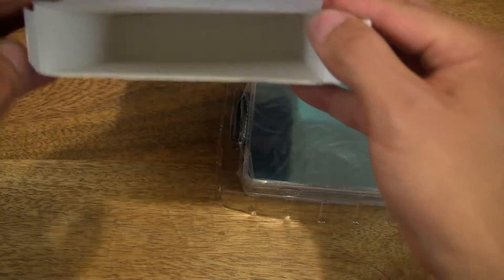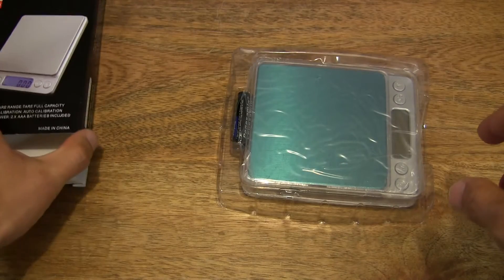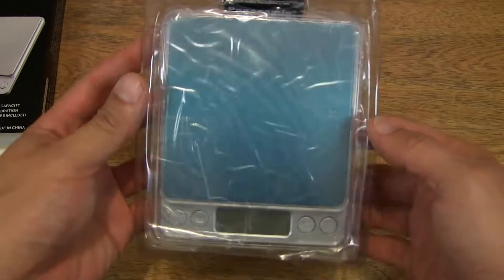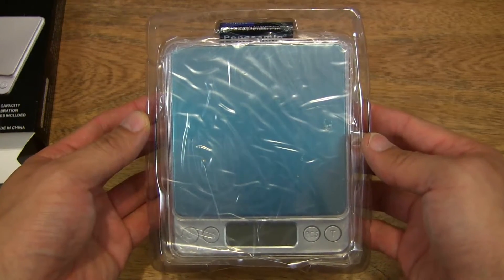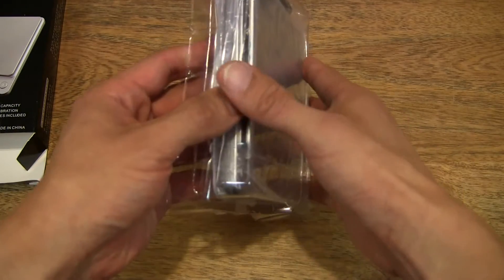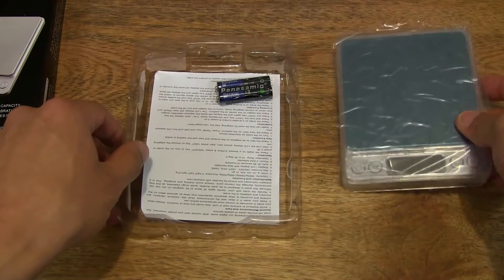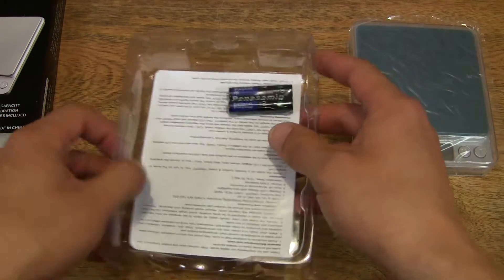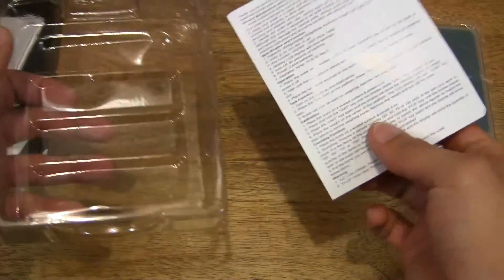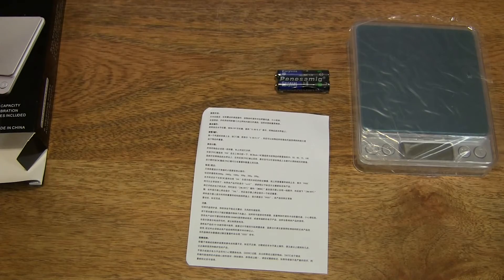Let's just make sure that there's nothing else left inside the box — that's just fine. So let's go ahead and set the box to one side. Then let's go ahead and pop the digital scale out from its clear tray, set it to one side, and remove the rest of the contents from the tray. So that's the tray emptied out, let's set that to one side.